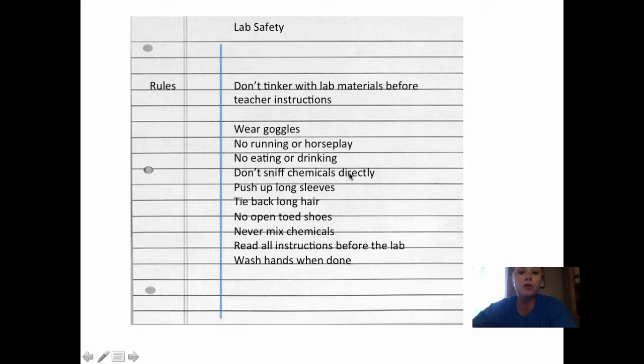Don't sniff chemicals directly. You may not have been able to tell from the video, but what that basically means is if there's something that asks you to smell something because it releases an odor, you're not going to hold it up and sniff it like that because it could burn your nostrils. So you will just hold the container. Say if this is your container, you would just hold the container over and then do like this so you can get the smell.